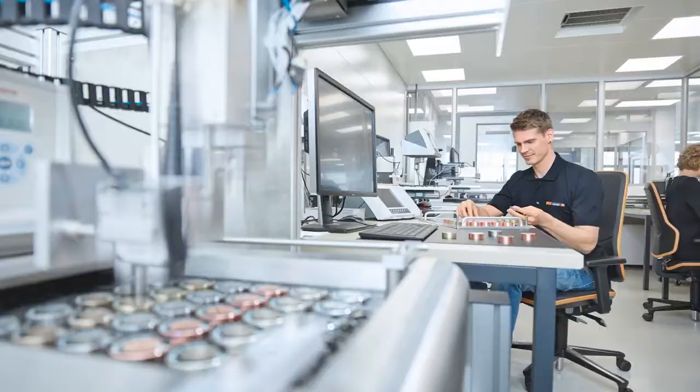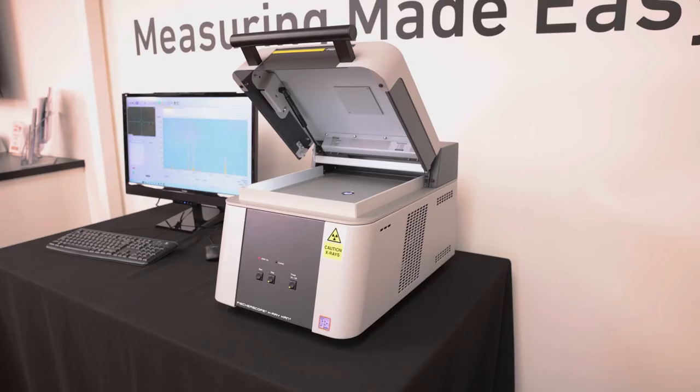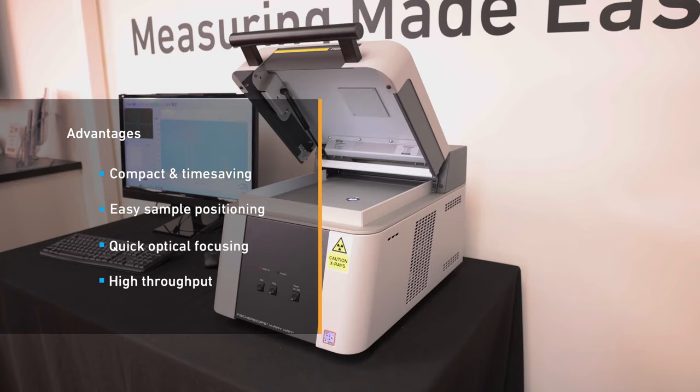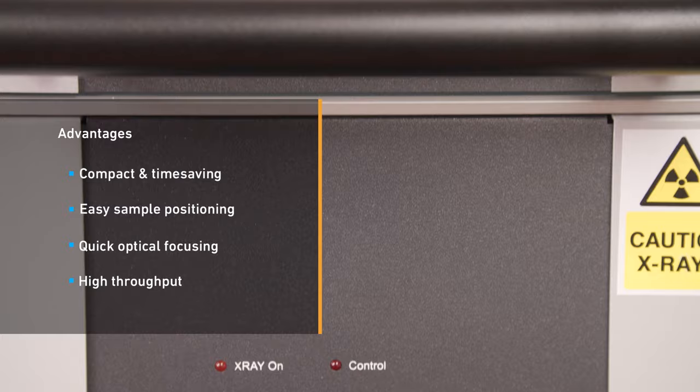The instrument is well suited for measurements in quality assurance, incoming goods inspection, and process control. The X-Ray beam direction is upwards, which allows a compact design that's perfect for a wide range of sample shapes and sizes. Optical focusing is quick and easy without the need for physical adjustments. It is ideal for high throughput and small batch sample analysis. The instrument has easy to use software, enabling powerful reports laid out in a simple way.